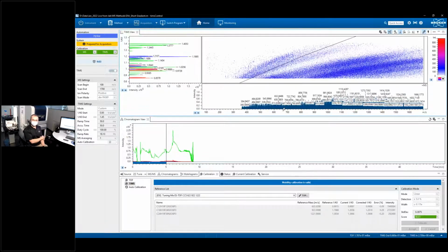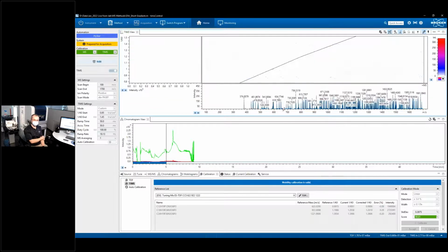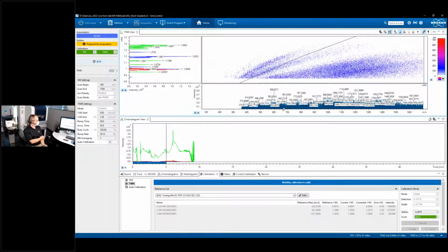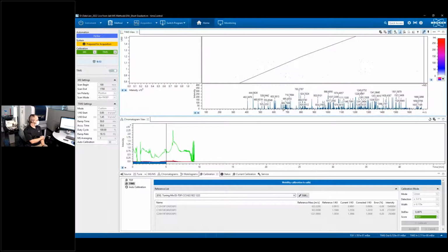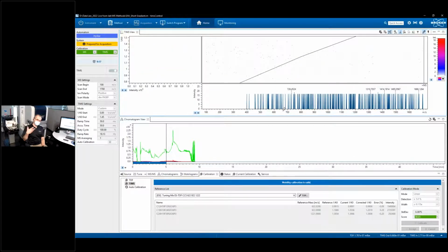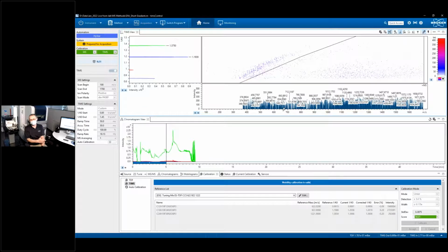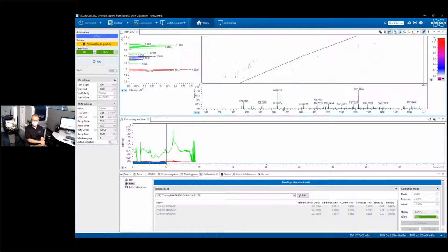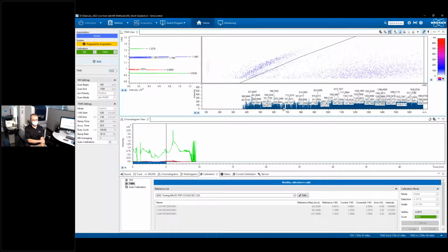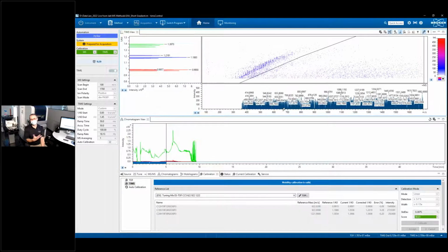Brilliant. Just a question: is there a library in the case of this DIA data, or do you do it library free? Yeah, fantastic. I didn't spend much time on that. In this case, we did a library-based search. Because we use K562 as our standard QC anyway, we have lots of DDA data on this. I think this was about 20 DDA files, which we used to create a library.